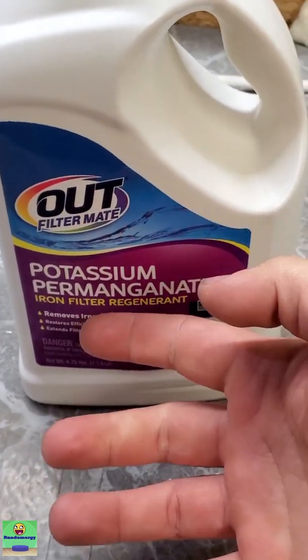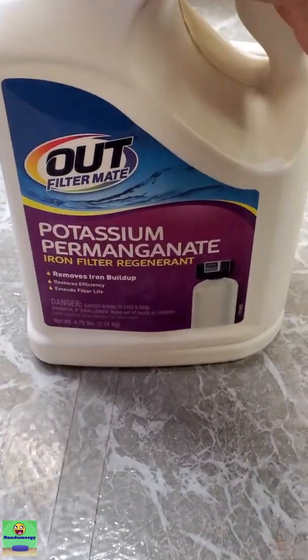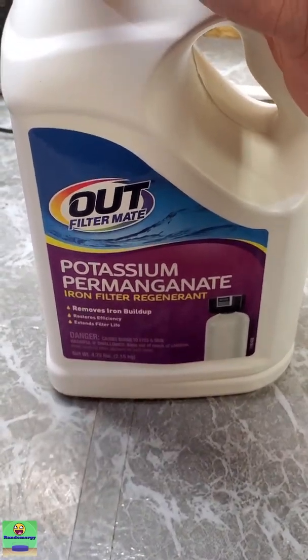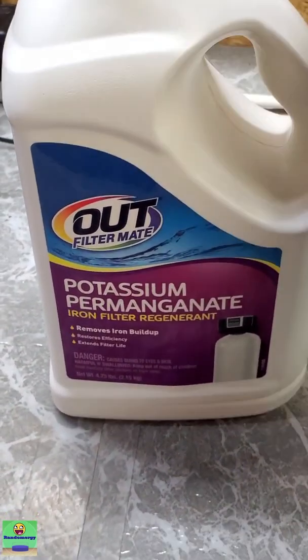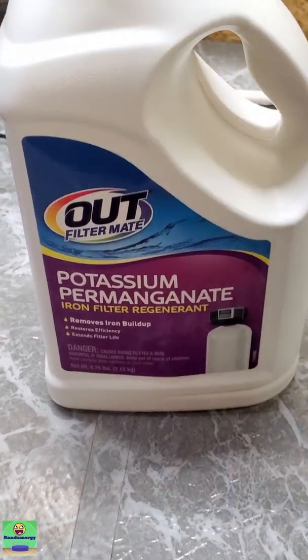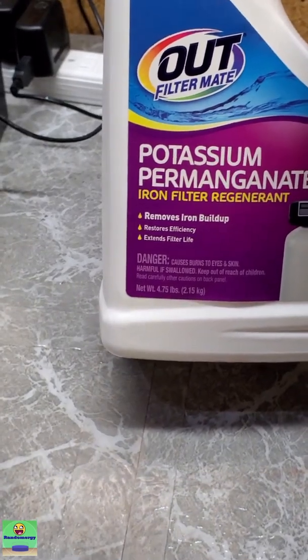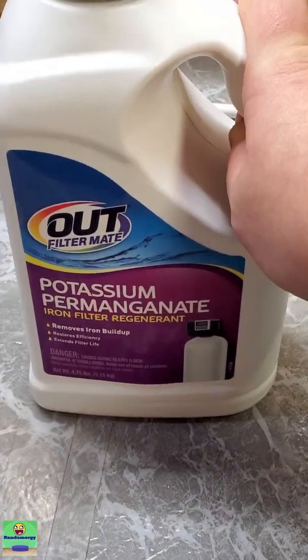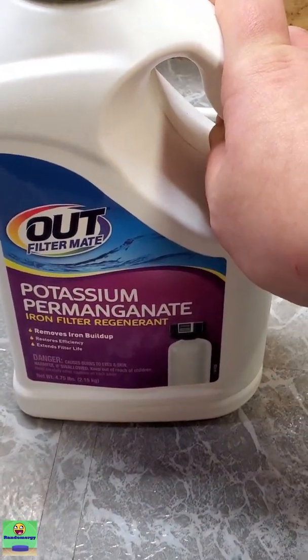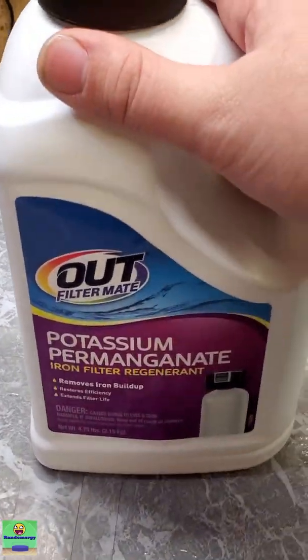Apparently this is a potassium permanganate iron filter regenerate. I've heard of people talking about this, but I've always been kind of jealous because I've never actually seen one at my local hardware stores. So whenever I saw this, I was like, oh yeah, I'm buying that. It's like 4.75 pounds. I think this was, it wasn't super cheap. It was like 30 bucks, but it's for almost five pounds of potassium permanganate. That's pretty cheap.